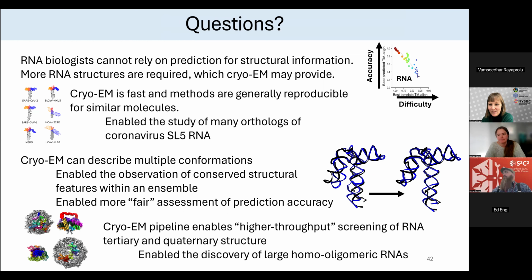Yeah, so we essentially want to make sure that it's in a consistent state. So if we denature them all at the same time and refold them all at the same time, now we know the majority of our molecules are going to be in a similar folded state. The other reason is when we are doing in vitro transcription, we are using a viral polymerase, so the transcriptional rate may be different from our native transcriptional rate. So we may actually not have the native co-transcriptionally folded RNA anyway.